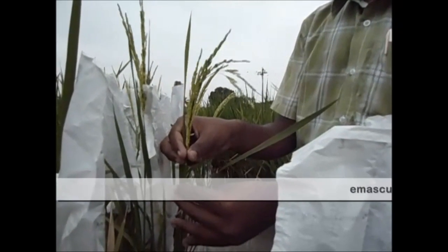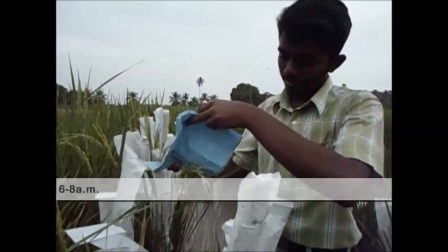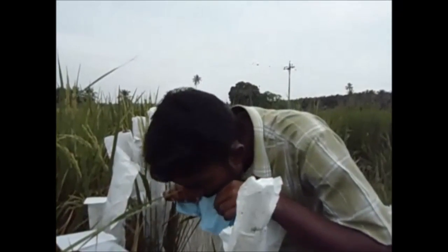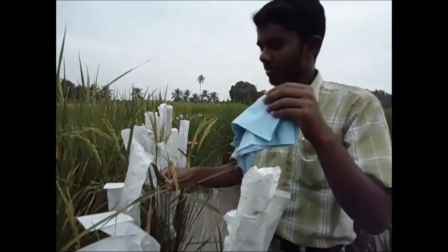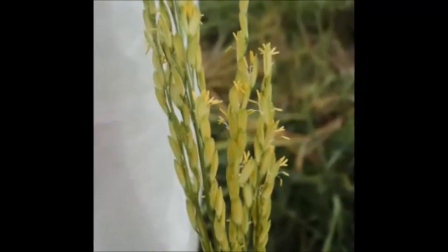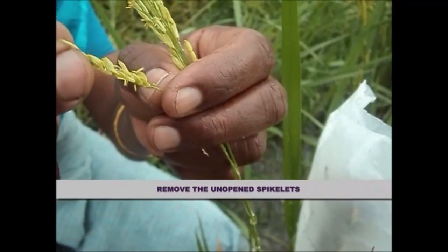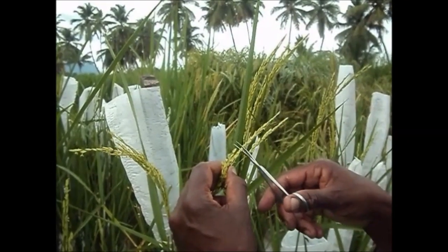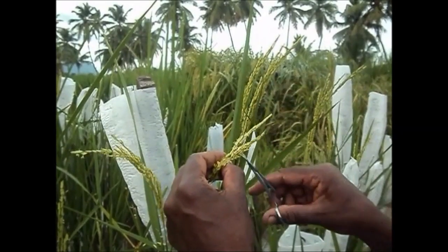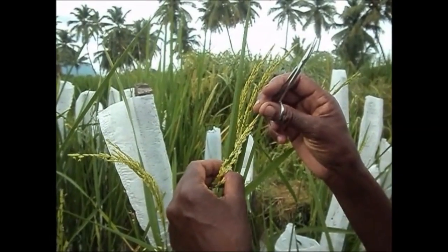Panicles of the desired female parent are selected for emasculation. In order to induce anthesis, heat is given artificially by blowing or covering the panicle with cloth. Emasculation is the process of removal of stamens or anthers, or killing the pollen of a flower without affecting the female reproductive organ. After blowing, the top one-third and bottom one-third portions of the panicle of the desired female parent are clipped off using scissors, leaving the middle portion of the spikelet. With the help of scissors, one-third portion of each spikelet is then clipped off in a slanting position.